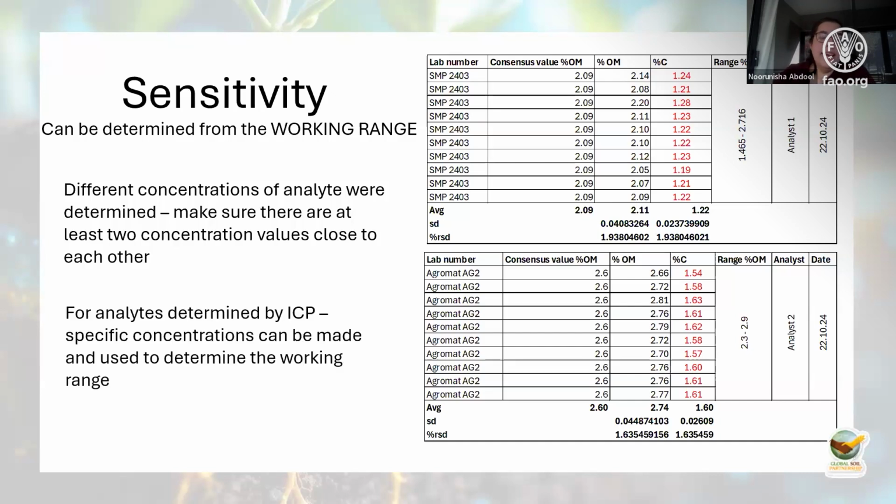And like I say, if you are doing ICP, for instance, you have to do this for every single analyte. So in the case of cations, it's all 5 of them, not just one of them.